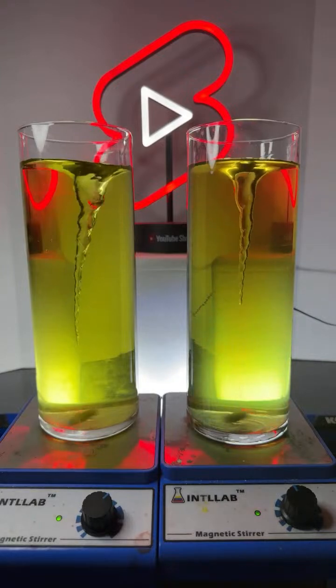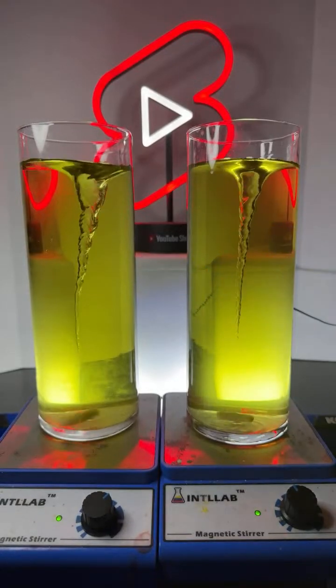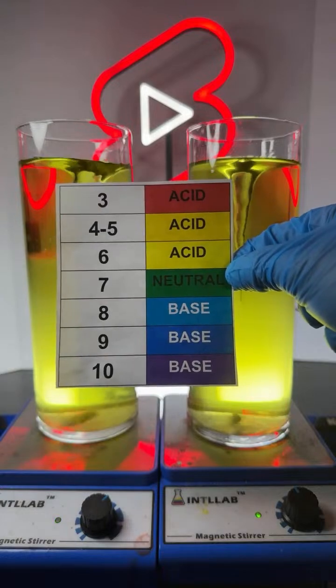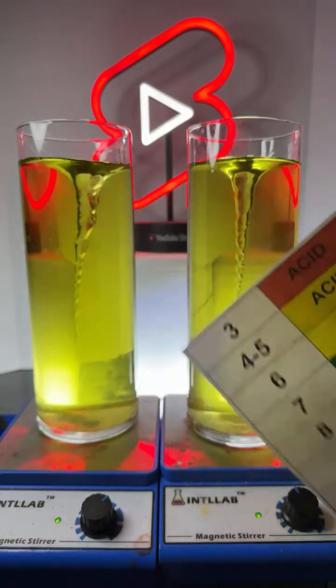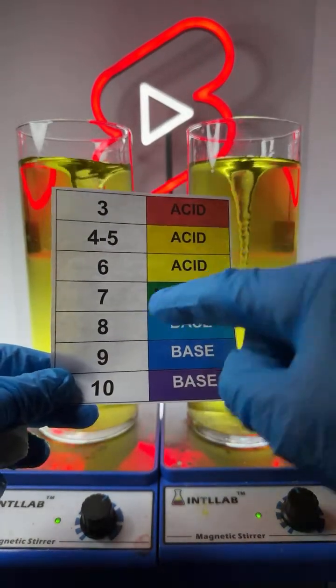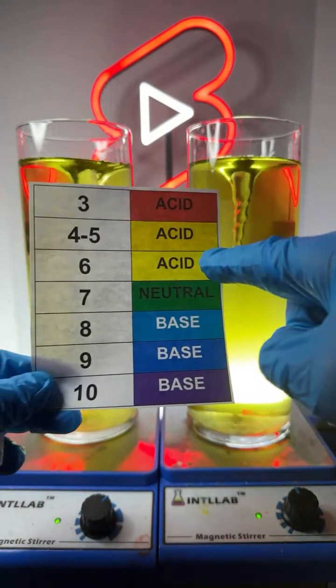I change it up, but this is what I usually do. I have 2 flasks here that contain universal indicator. Universal indicator is also known as rainbow indicator. It displays these colors depending upon pH, which is how acidic or basic something is. Right now, the flasks both appear yellow or maybe a little yellow-green, and that tells me that their pH is a little bit below 7, 6 or 7, and so they're slightly acidic.